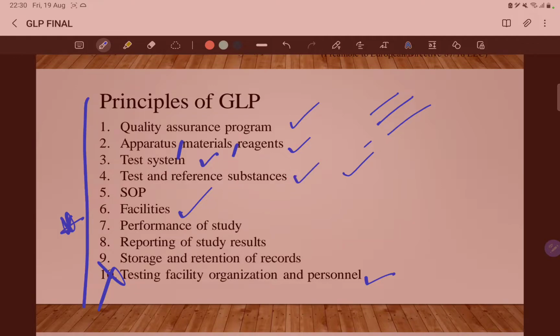Test and reference substances: receipt, handling, sampling and storage, characterization, known stability of test and reference items, stability of the test items in its vehicle or the container, experiments to determine stability in tank mixtures used in the field studies, and samples for analytical purposes for each batch.